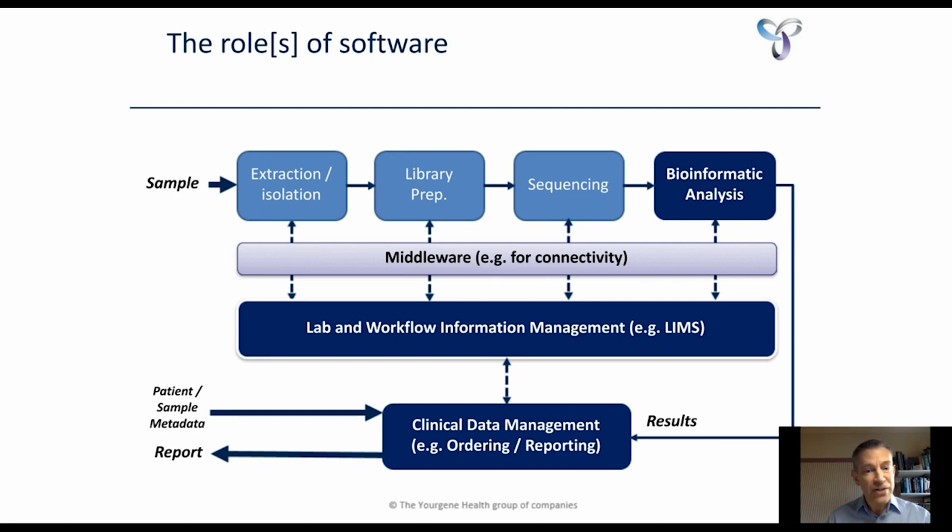There is a clinical data management function as well. We need to get the patient and sample, the test request, and the patient and the sample metadata into the lab in the first place. And we've got to get the report and the results back out again to the right place. So we need a system that can handle that data transfer efficiently and accurately.